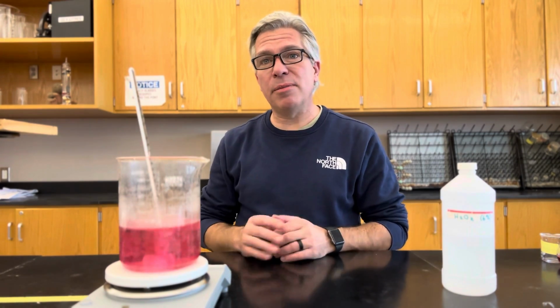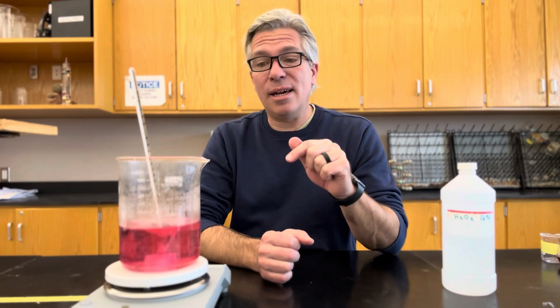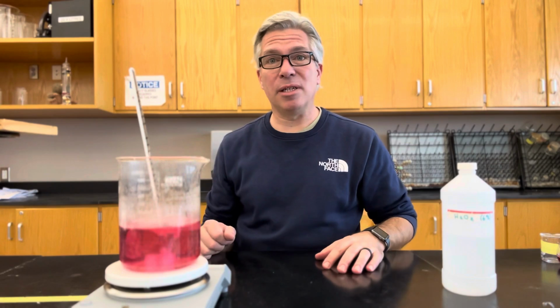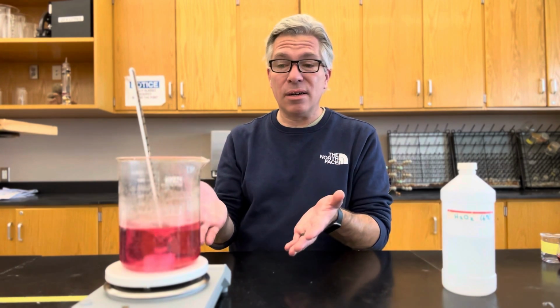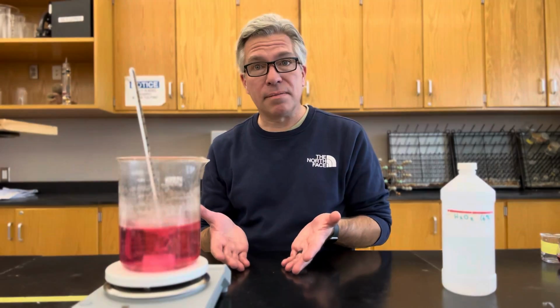One of the criteria for being a catalyst is that the catalyst itself is not a part of the reaction. It's not used up in the reaction. In this case, the cobalt ion goes from +2, which is pink, to +3, which is green, and at the end of the reaction, it gets its electron back, and now we're back to being pink again. So the cobalt is still there. It did not get used up in the reaction, but it certainly helped the reaction along.